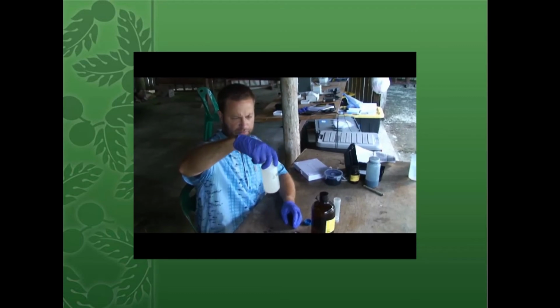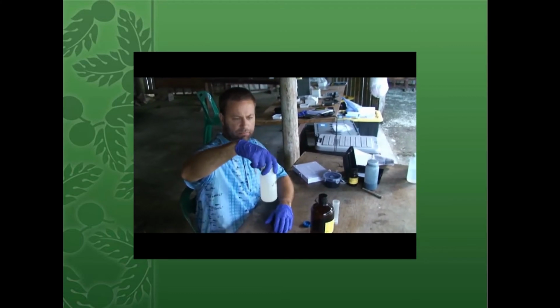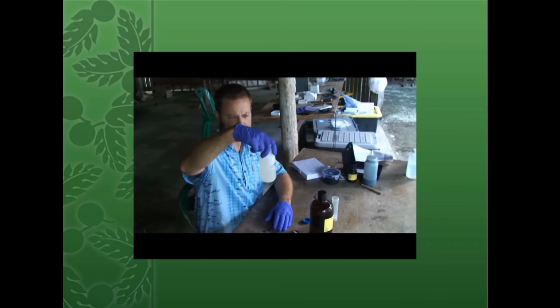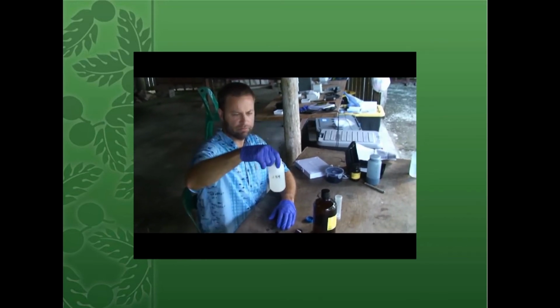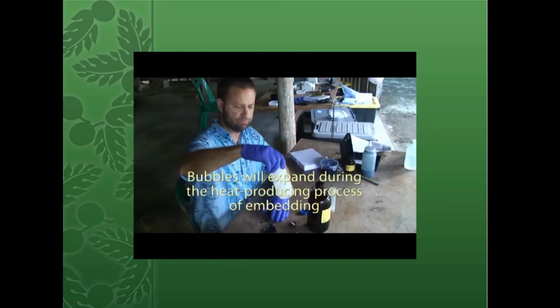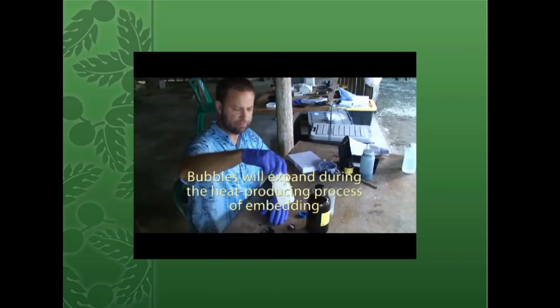mix it around for about a minute, let it sit for a couple hours, come back, see if it still needs to be mixed a little bit more, but you don't want to shake it because that gets air in there. Move it around. Don't shake the JB4. Don't shake the JB4. All right.